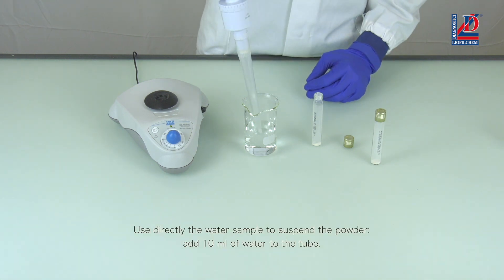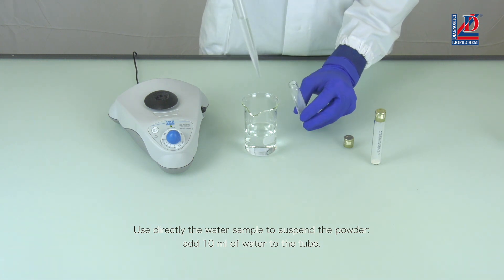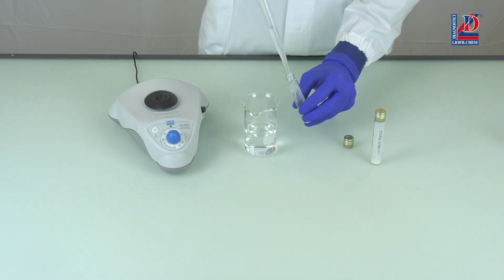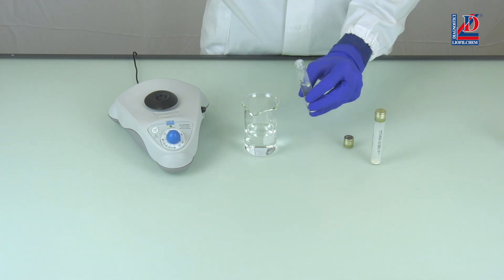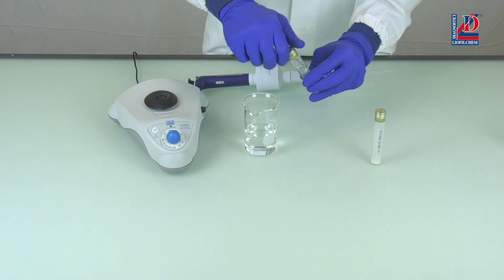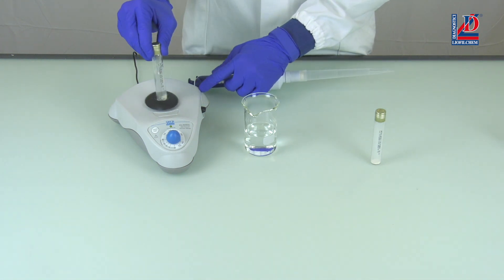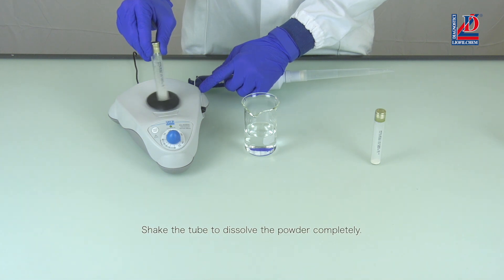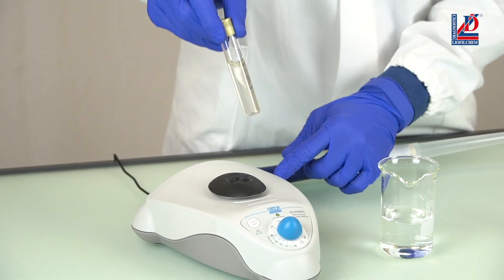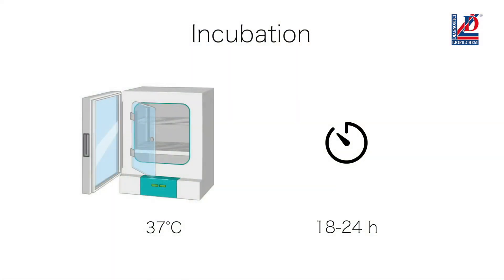Use directly the water sample to suspend the powder. Add 10 milliliters of water to the tube and shake to dissolve the powder completely. Incubate at 37 degrees Celsius for 18–24 hours, or at room temperature for up to 48 hours.